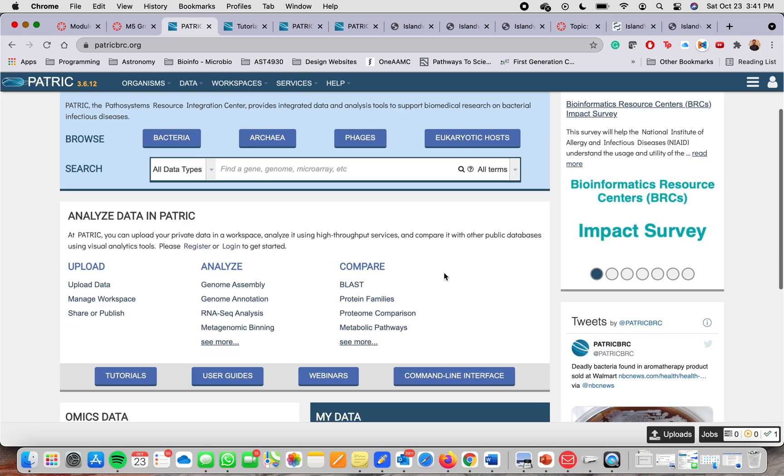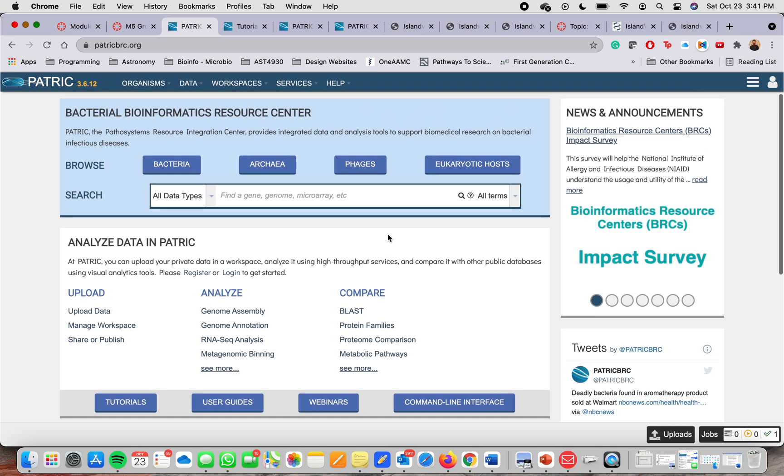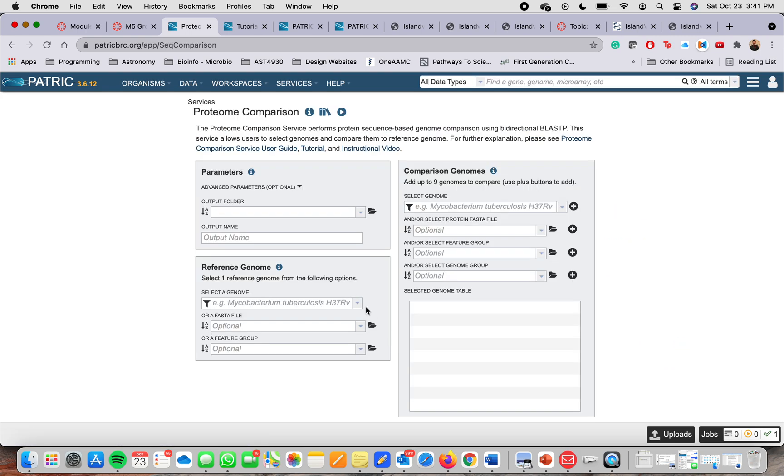And then if you want to compare, we want to compare two genomes, we're going to go to here, compare. And we will look into protein comparison. You click there. And now here it's a little more complex than the other tool, but it's very easy. It's nothing difficult.